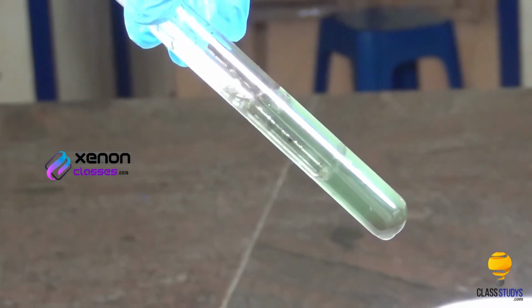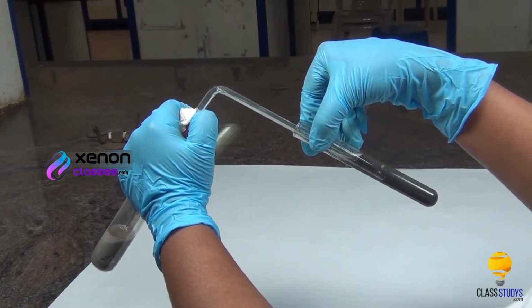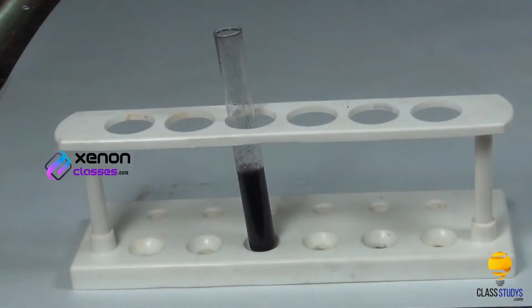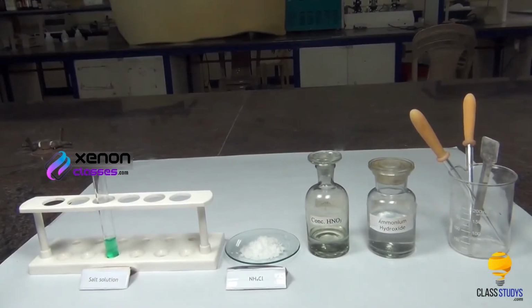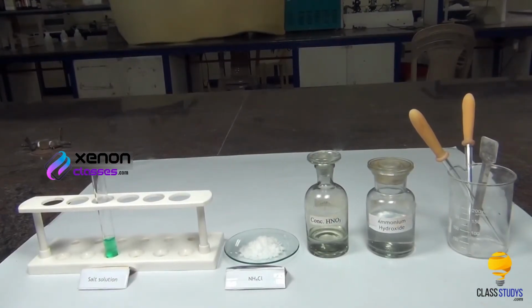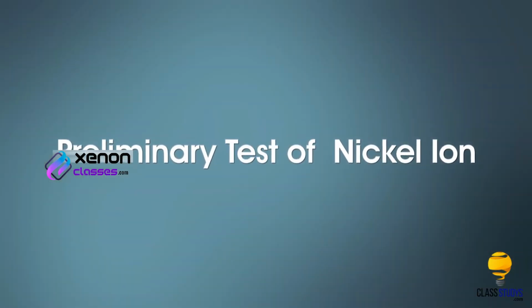In group 4, nickel ions are precipitated as their sulfides by passing hydrogen sulfide gas through their solutions. Our aim here is to test for the presence of nickel ion in a given salt. First, we look at the preliminary test of nickel ion.